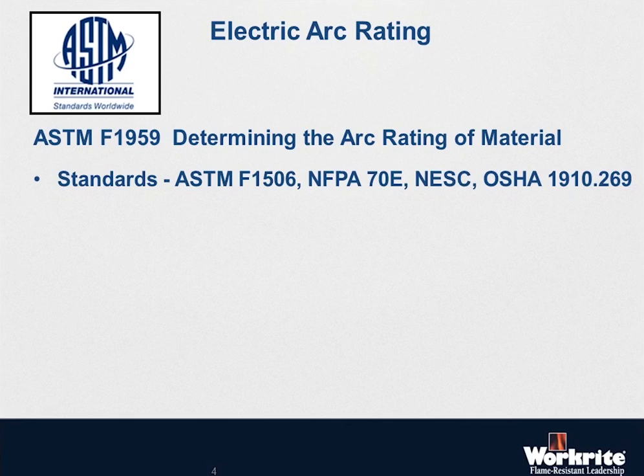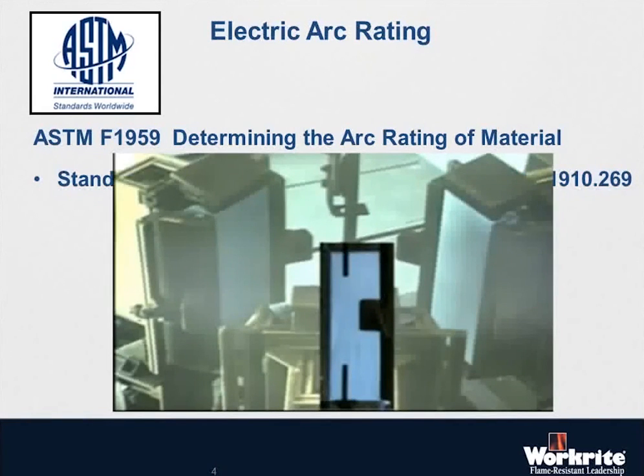What you'll see are several panels. You'll see a close-up shot of one panel with the fabric on it, and then a very fast explosion. It just happens in a split second, but all those samples have sensors behind them that are going to read the heat flux and thermal transfer through the fabric onto the sensor.